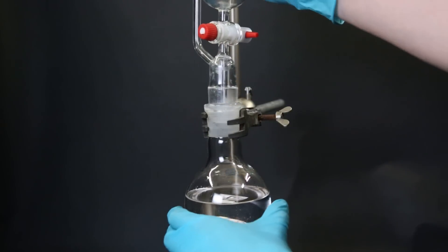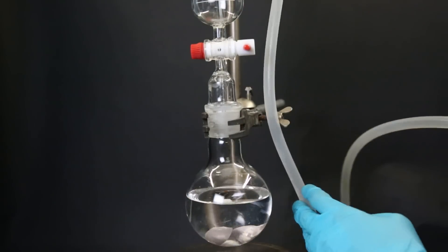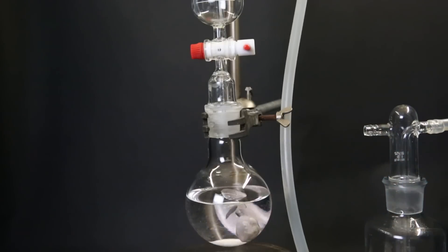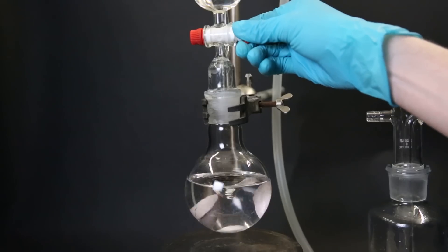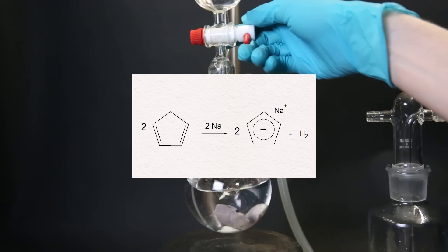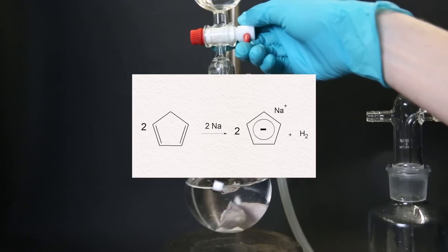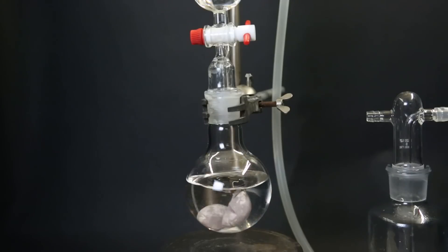I then attach a dropping funnel and a gas washing bottle. With the gas washing bottle, we again prevent air from destroying the product, but we can also track the progression of the reaction because hydrogen gas will be released. So to the dropping funnel, I add in about 31 mls of cyclopentadiene. I then slowly add it to the flask. In this reaction, the sodium metal will react with the cyclopentadiene to form the sodium cyclopentadienide salt. As the reaction progresses, the solution will take on a dark brown to red color, and we can track the production of the salt by seeing hydrogen gas bubble through the gas washing bottle.